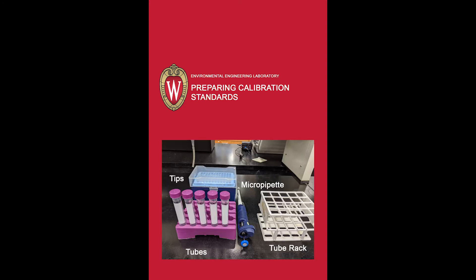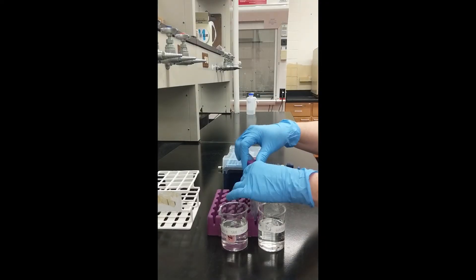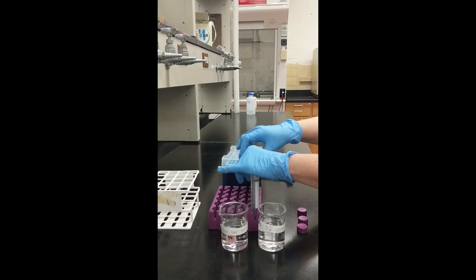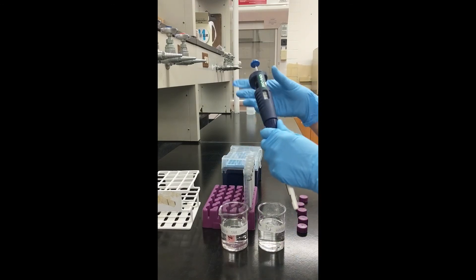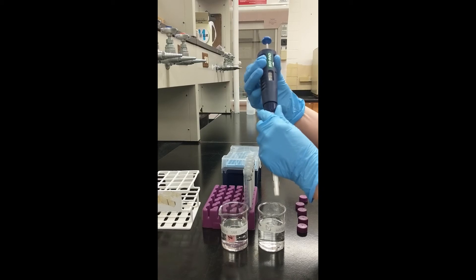The second way to prepare a set of calibration standards will require a micropipetter, pipette tips, disposable or glass tubes, and a tube rack if needed. Remove caps and label each tube. Next, adjust the micropipette to the desired volume by twisting the dial near the top.